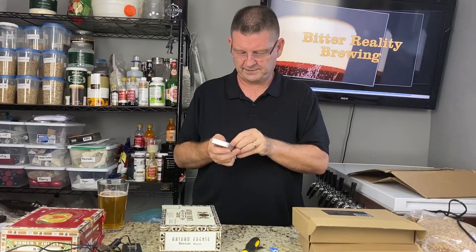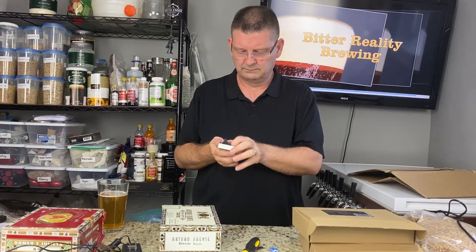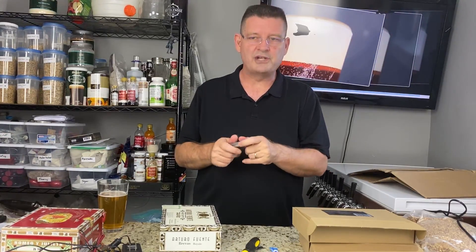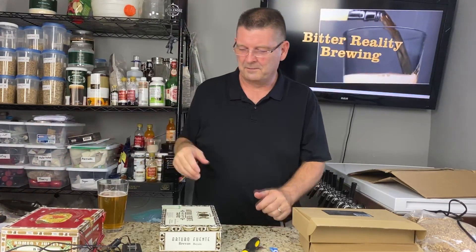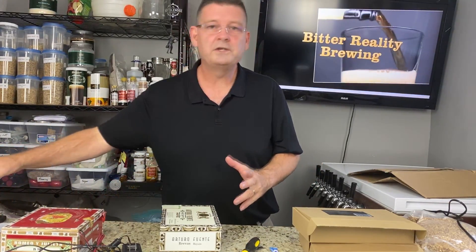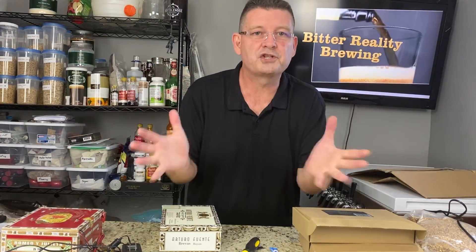Do not put these near electronics — I promise you, do not. They're very strong and they will jack it up, especially screens or video screens. So let me show you what most people will tell you on the internet on how to make a stir plate.